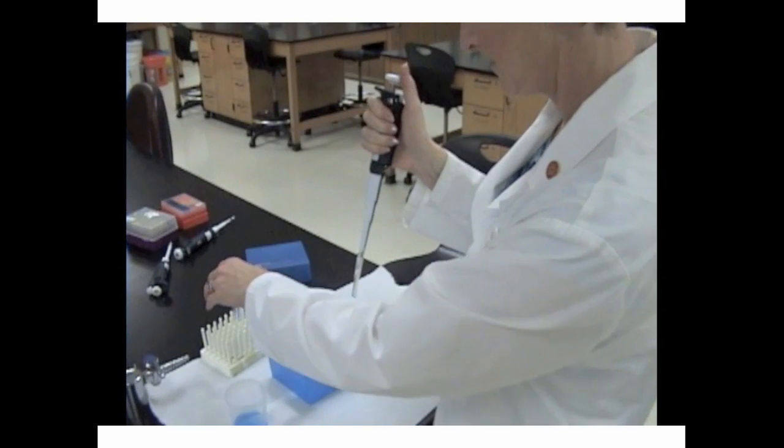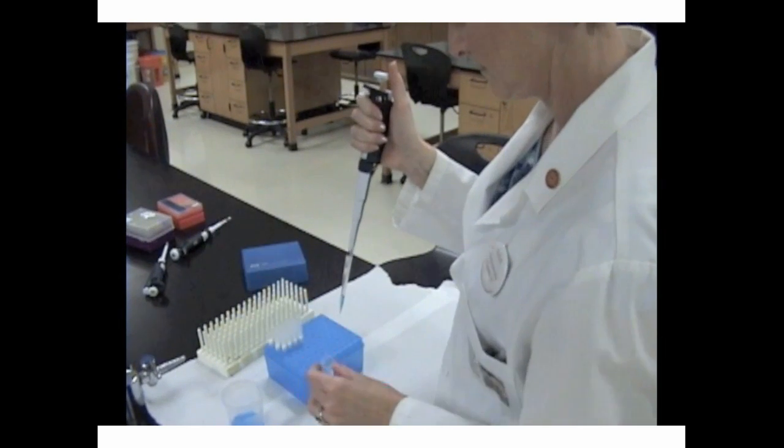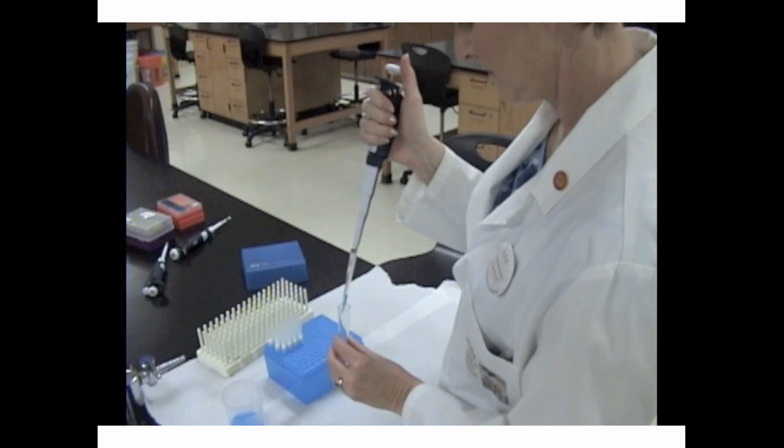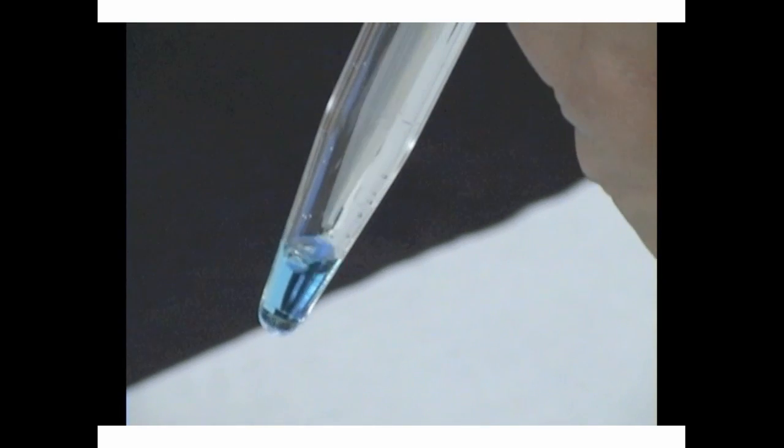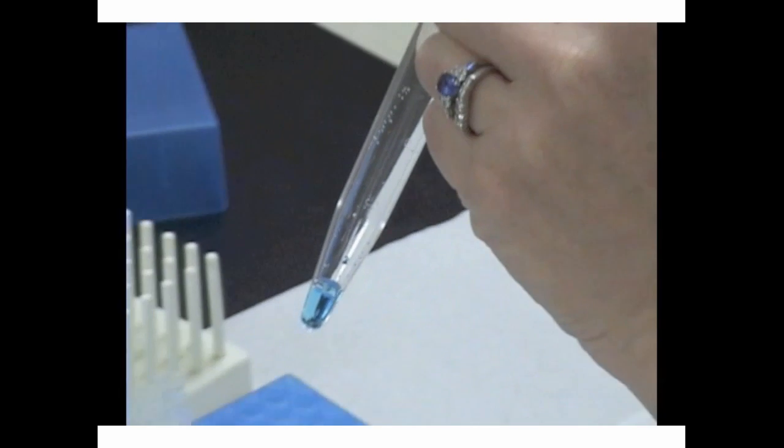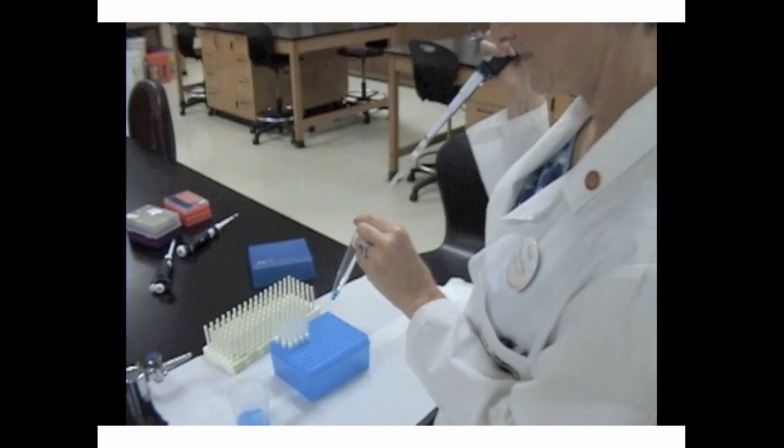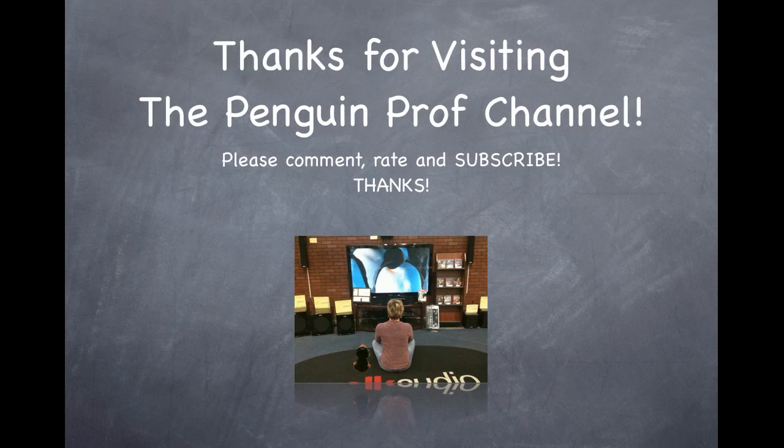Next, I'm going to take the tube that I'm going to be dispensing into. I'm going to insert the tip. I'm going to press down all the way to the first stop and then to the second stop. That's going to give a little bit more of a push. You can see the bubbles there to release any extra droplet. And there you have it.